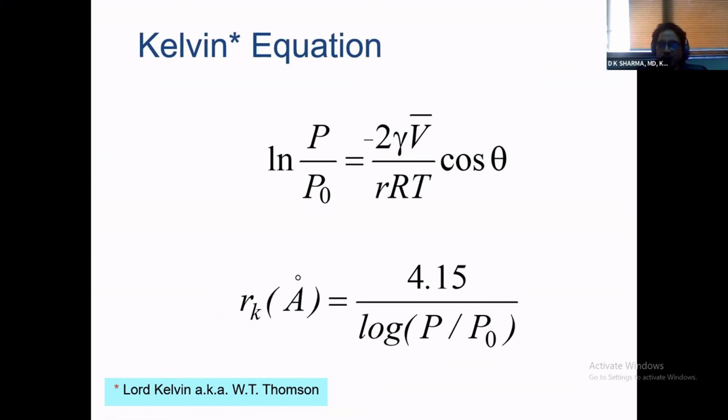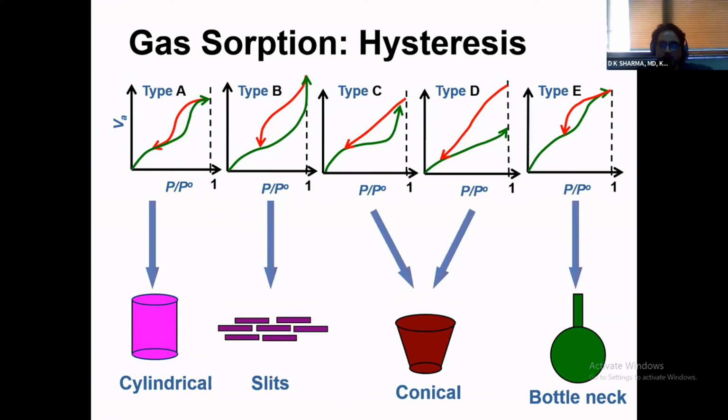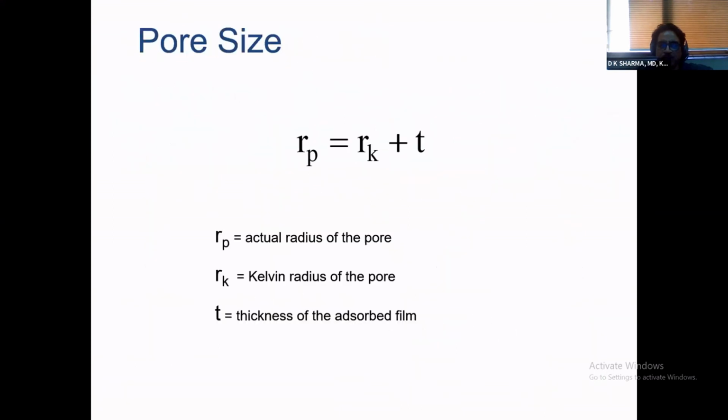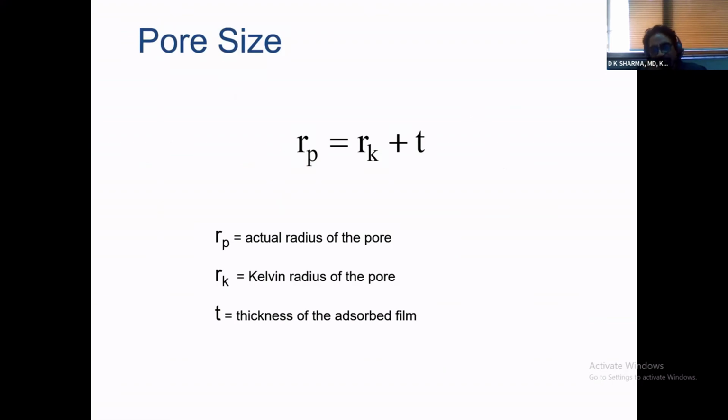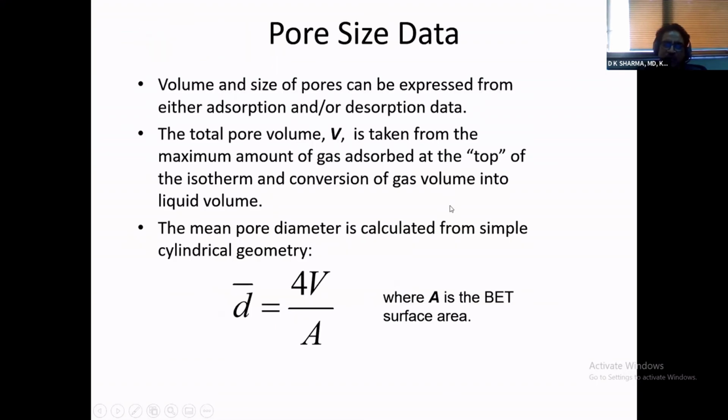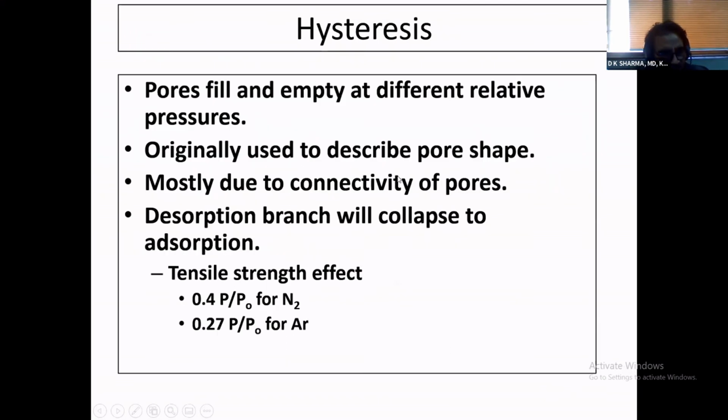The two combined together will give you the pore radius, or pore diameter if you multiply it by 2. In all these discussions, we have not talked about thickness. I'll spend some time on it. Let me first take it further. Okay.